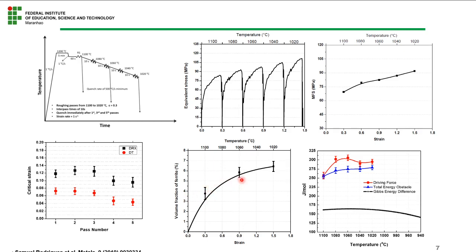And also, after the third pass, where the accumulated strain was 0.9, repetition that also had 10 seconds between times. And as the ferrite is formed, we have 10 seconds between times. And during this time between passes, the unstable ferrite is inside the austenite phase field, so some portion of ferrite retransforms, or transforms back, into austenite.